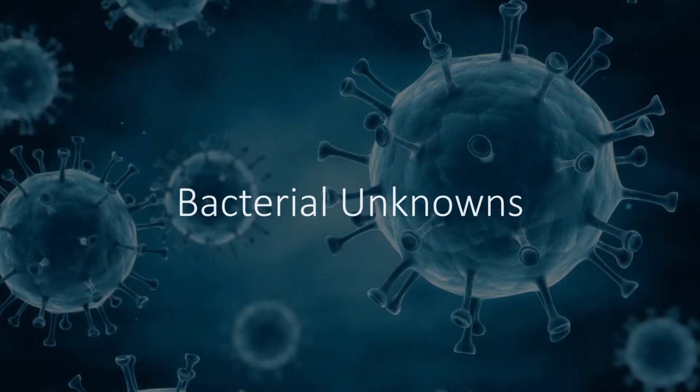All right, guys, we're going to be talking about bacterial unknowns and the whole process for doing this. It is something that we haven't done quite the same way this semester as we have in the past, so we're all going to be learning together. It's going to work out pretty well as long as you guys follow the instructions.